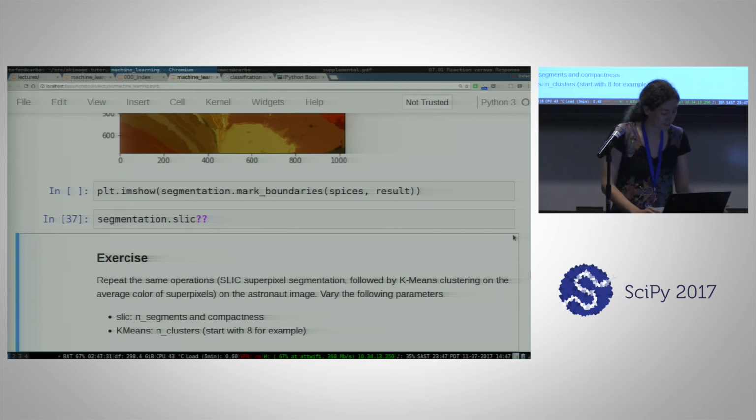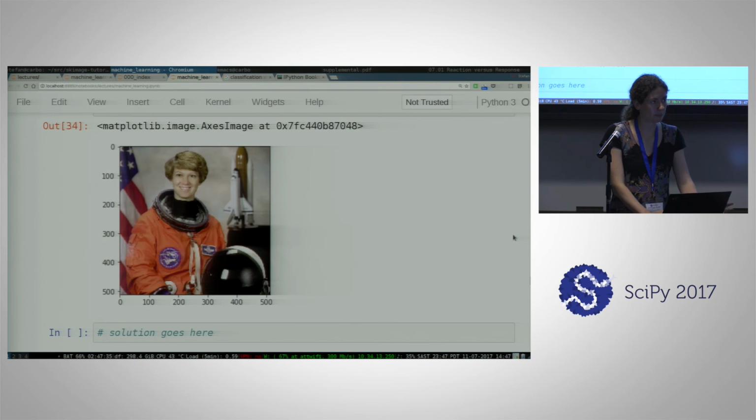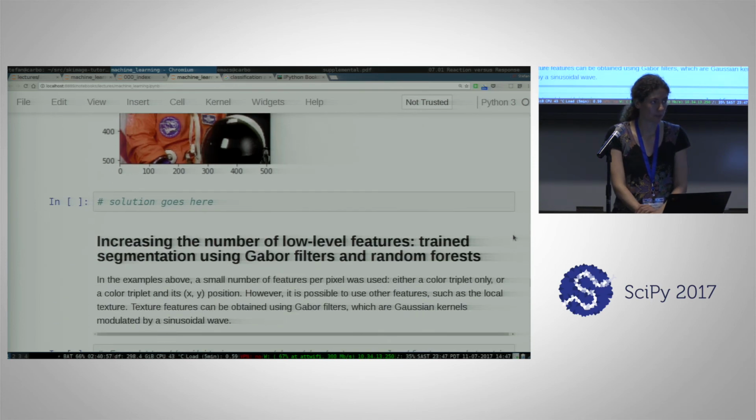Yeah, sure. Another common approach is to over-segment the image, and then we've got region adjacency graphs. So you can set up a graph across your whole image, across all the superpixels, and then you merge the superpixels according to some rule. So that way you can start with the big over-segmentation and then just merge them into bigger superpixels until you're satisfied. There's an entire segmentation tutorial in the tutorials folder, the lectures folder.